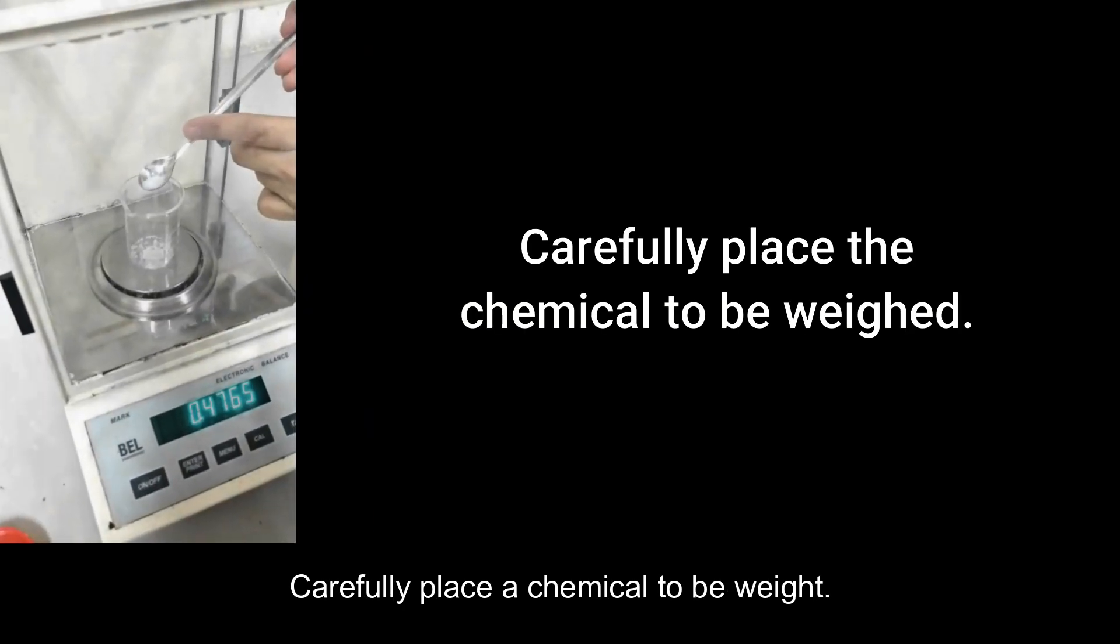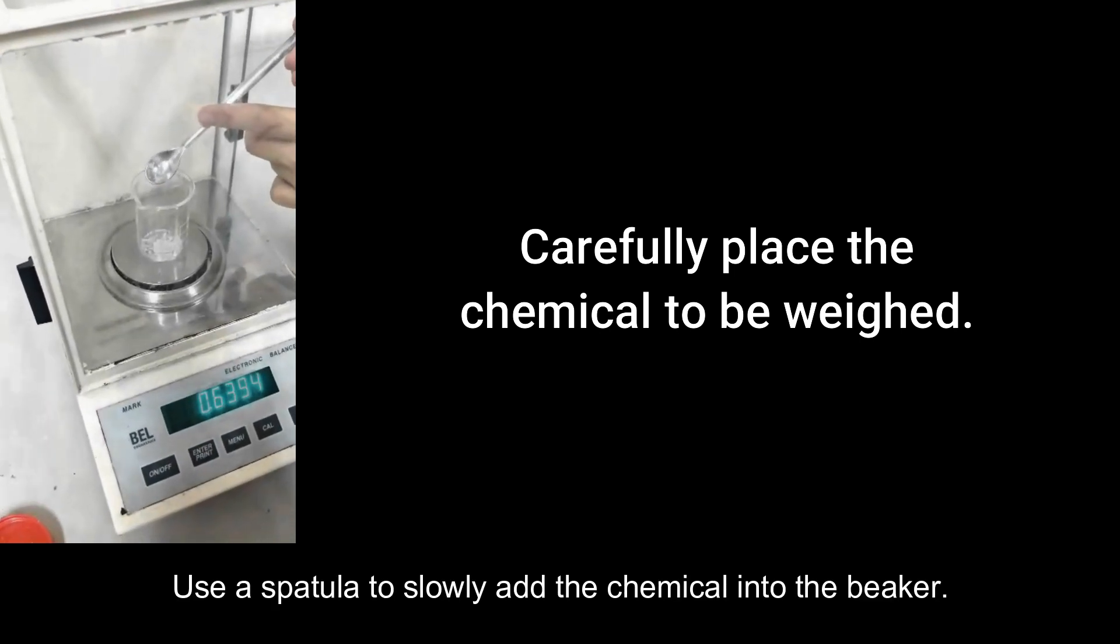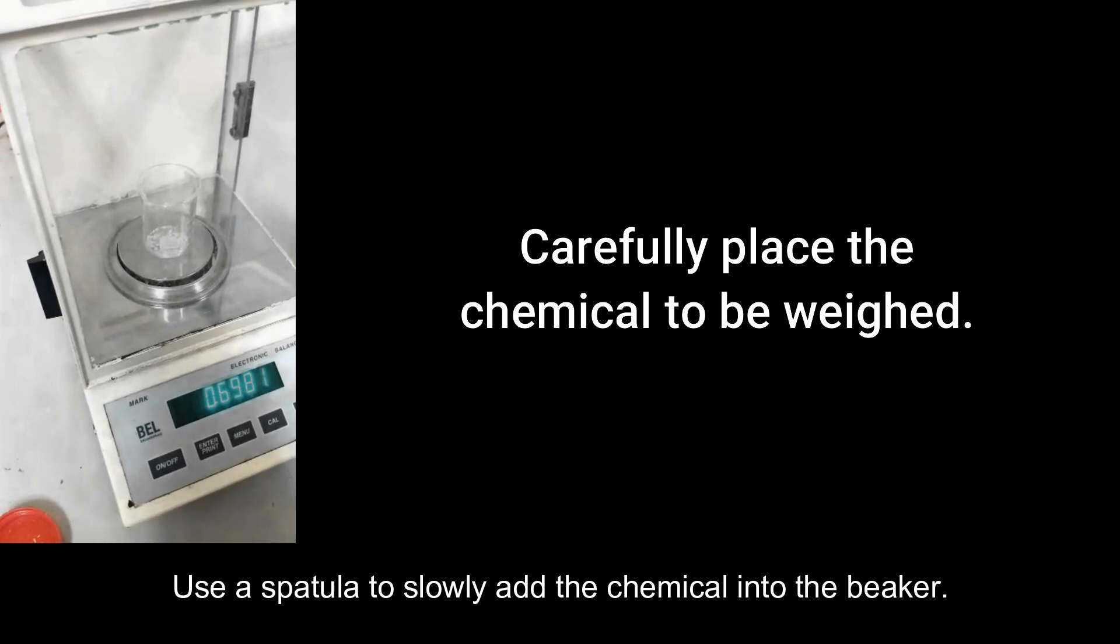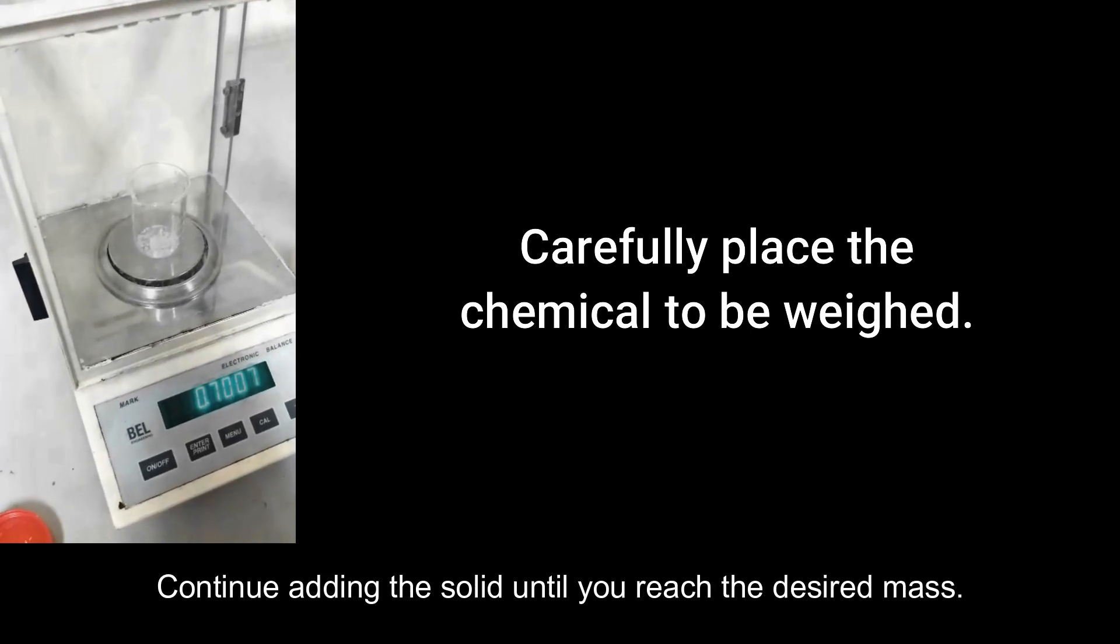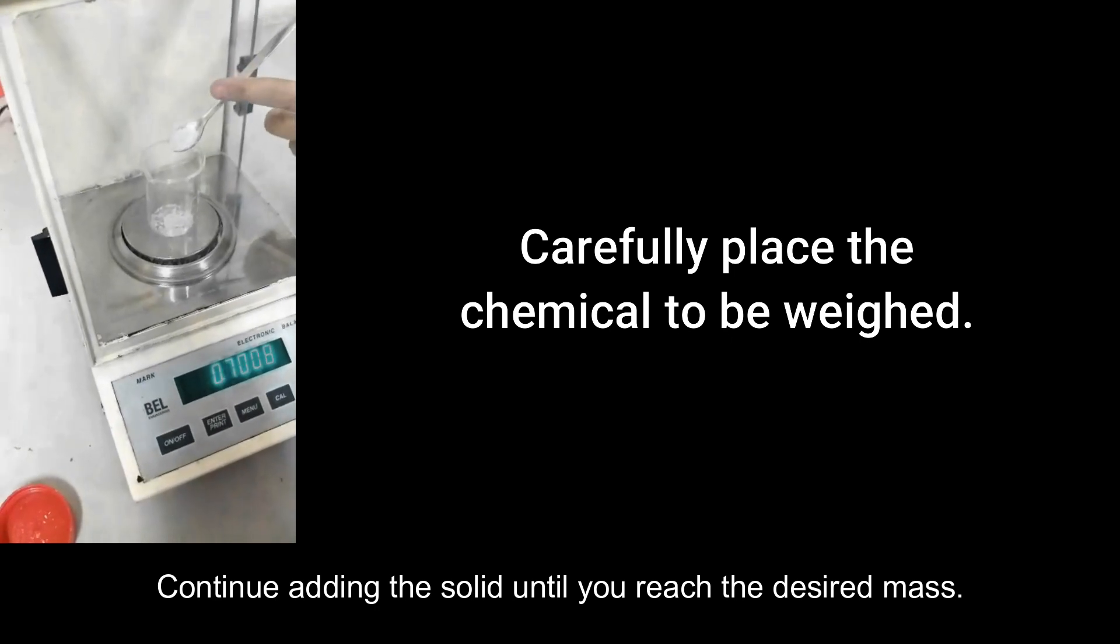Carefully place the chemical to be weighed. Use a spatula to slowly add the chemical into the beaker. Continue adding the solid until you reach the desired mass.